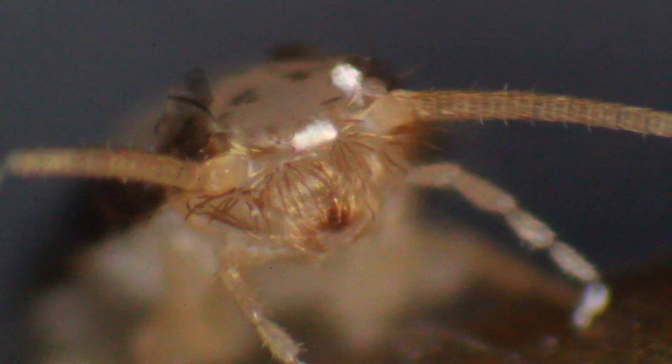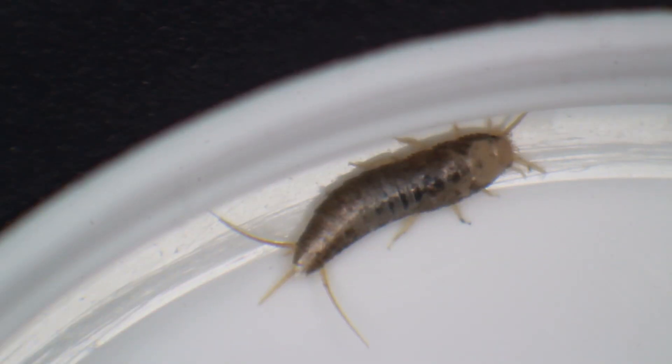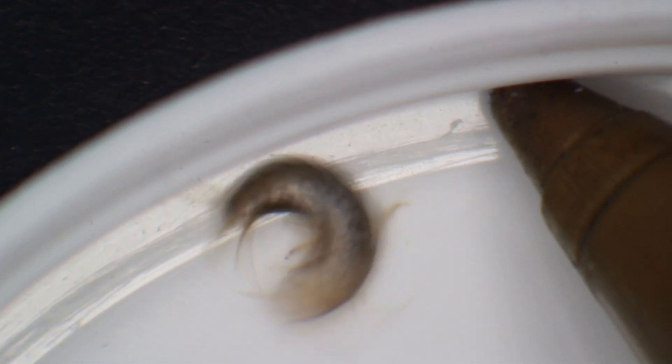Here you can see the maxillary palpi and the long antennae again. Silverfish look kind of cute under the microscope - I can highly recommend them. I try to push it a little bit and look how quickly it runs away! I was not able to count the number of legs when it was running.